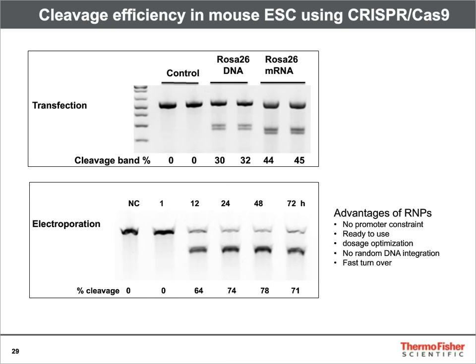In addition to higher editing efficiency, RNP provides several other advantages, such as it is ready to use, there is no requirement of promoter, and there's no random integration in the genome.